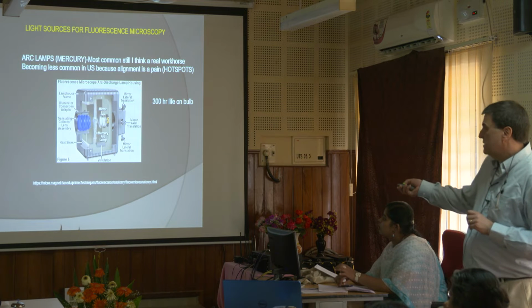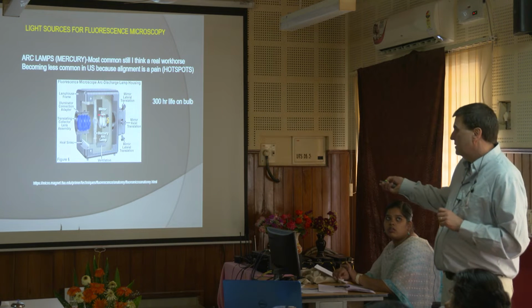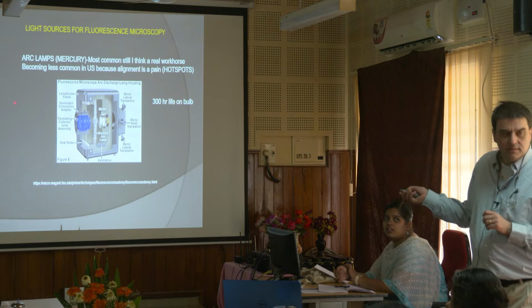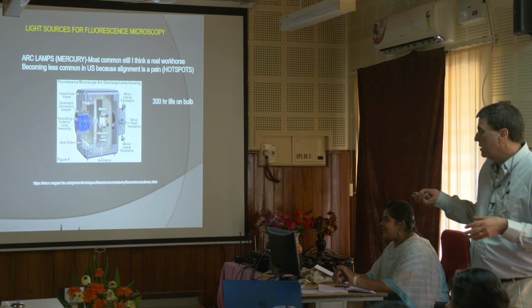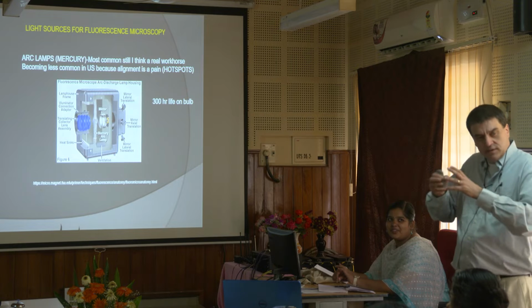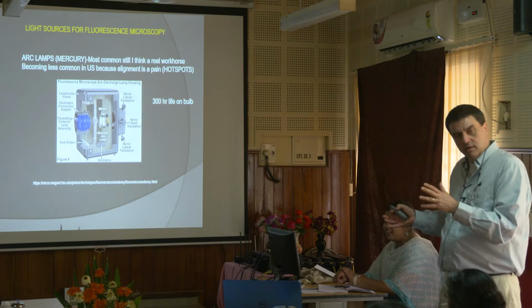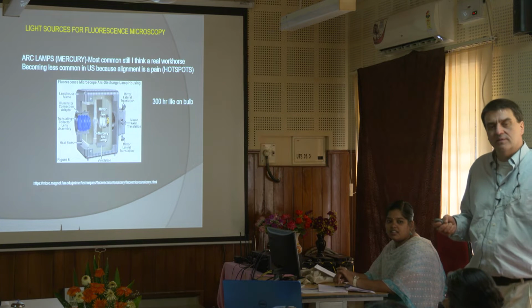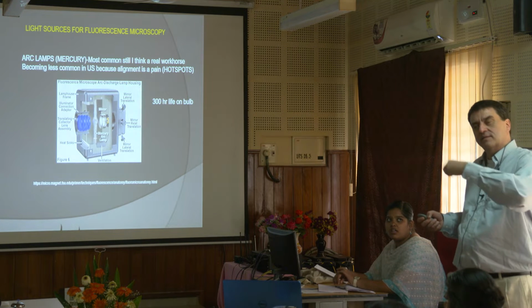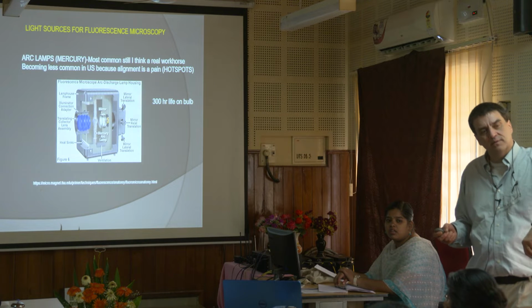The other thing about these, in the old days, I had customers with these older ones that would literally fry their computers. They would have this sitting right next to a computer. The computer would be on, and when you fire this up, it has so much energy, it throws out an electromagnetic pulse, and it would literally fry the computer. So the old rule, and I think still the rule today you should follow, is anytime you turn on a fluorescent light, that's the first piece of equipment you turn on, and at the end of the day, it's the last piece of equipment you turn off.